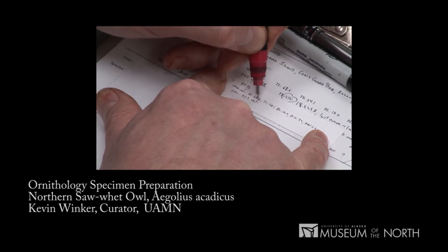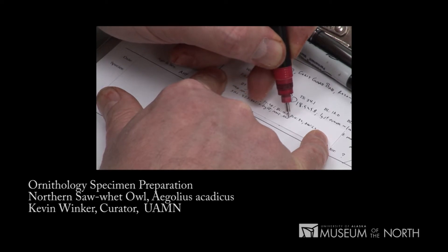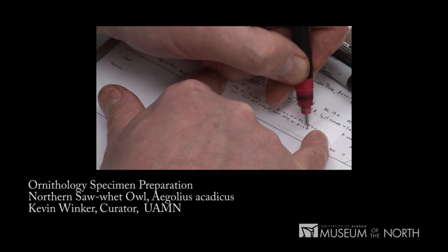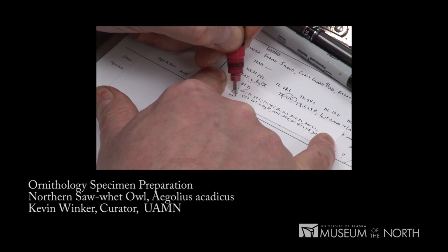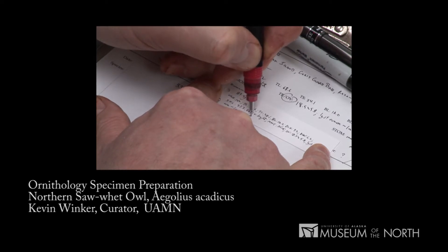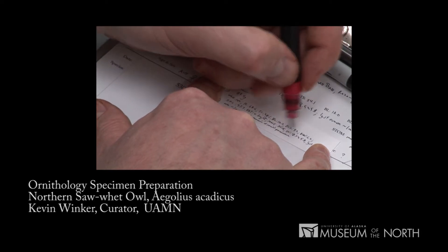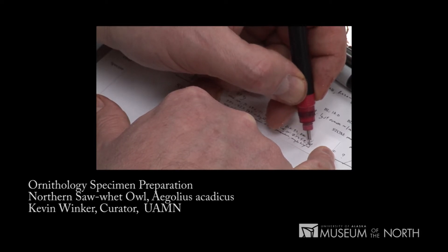The fat was very light. There was no molt. The ovary was 18.5 millimeters long by 5.8 millimeters wide, with the largest ova approximately one millimeter in size. The stomach had the remains of a small passerine. We thought maybe it was a kinglet — somebody can look at that later and confirm it.